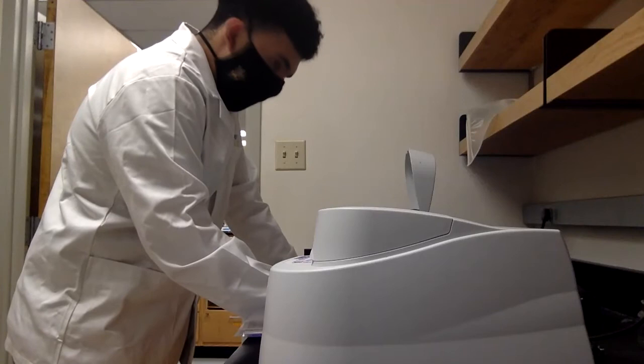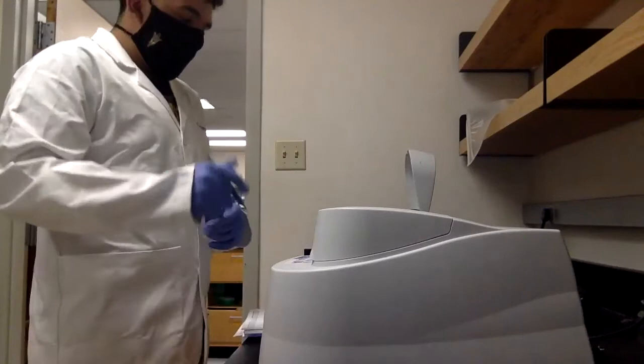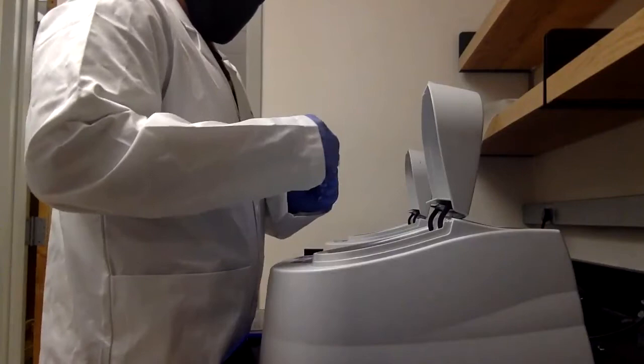Okay. Now we have all the data we need for today. You just take this out and dump everything into the liquid waste in the fume hood. And that's all the data you need. I will show you guys how to process the data later. We just got three data points, the absorbance for three concentrations of the stock.